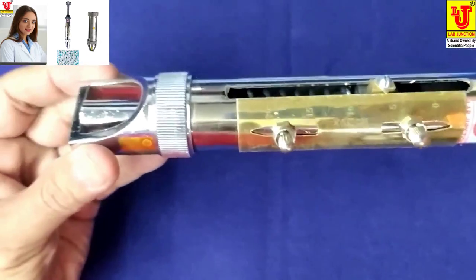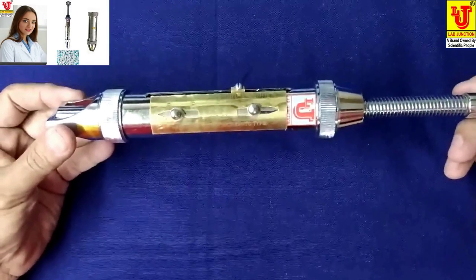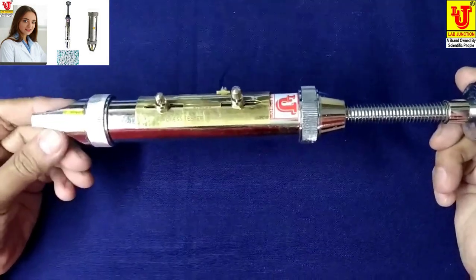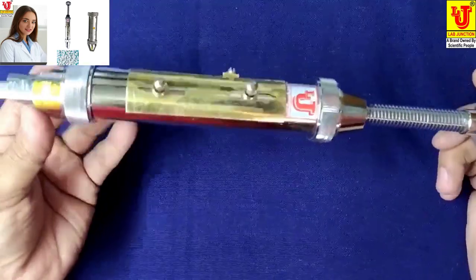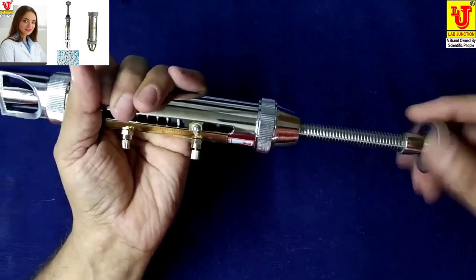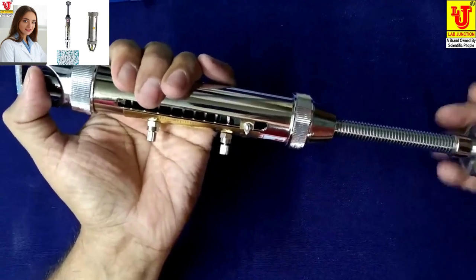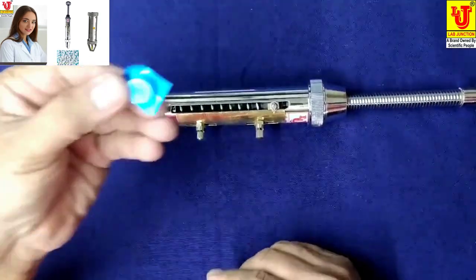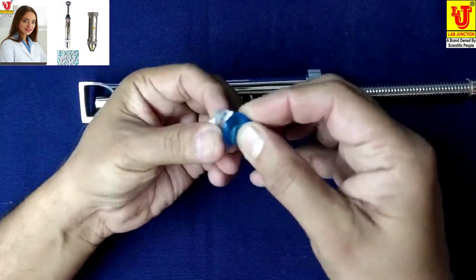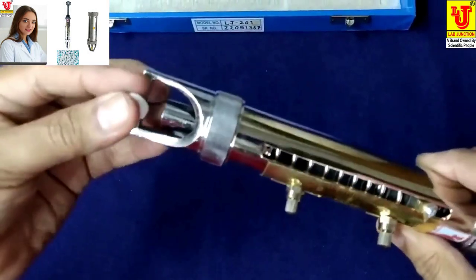This is our hardness tester. First, you loosen this. This is a 12 mm tablet. You fix it like this.